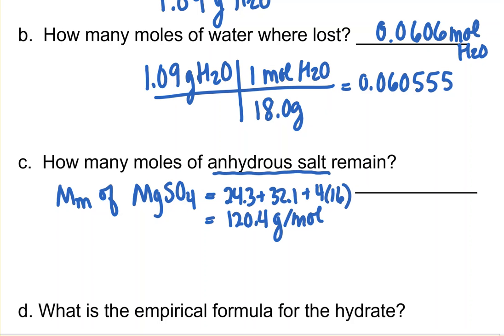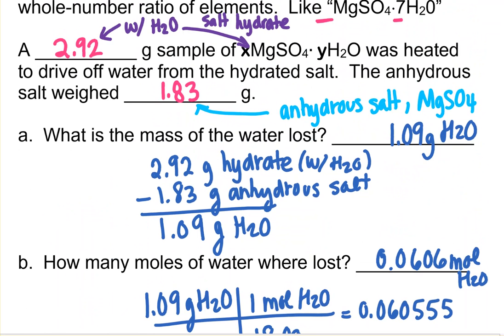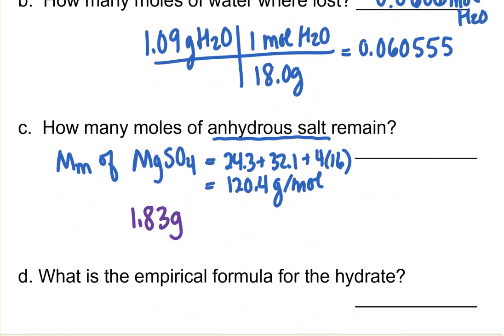Okay, and then I'll take the mass that was remaining, and just to remind you, I'm getting that right here. That was after it heated, the mass.